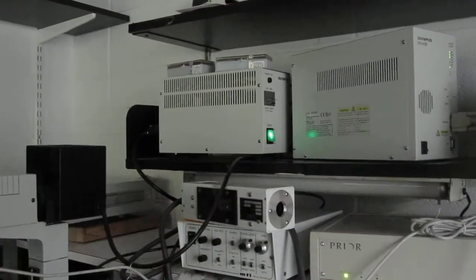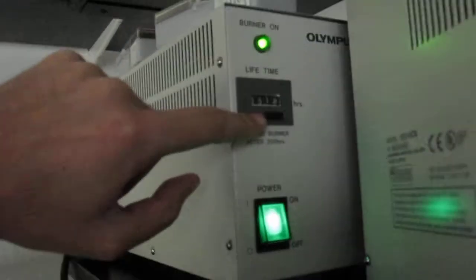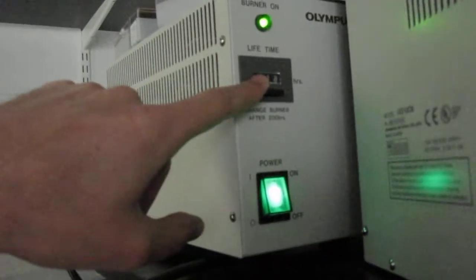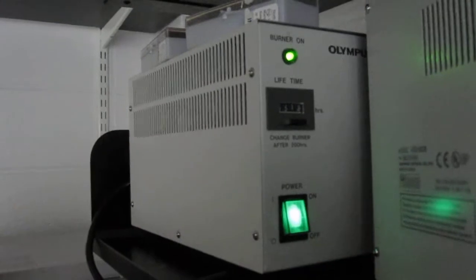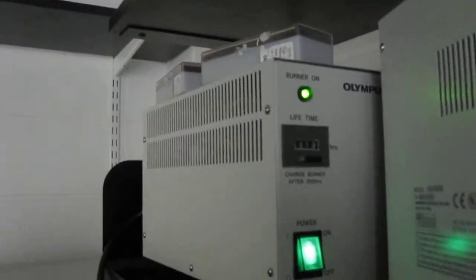As you will see, that's the hours that the bulb has been on for. It says 600 something, right? This is way too much. The maximum is supposed to be about 200, and as the hours get higher, the light starts to flicker, and you don't have a constant light when you do experiments, which can be bad if you're doing things like videos. So the bulb needs to be changed, and that's something that actually should be changed now. We'll leave that for another time.